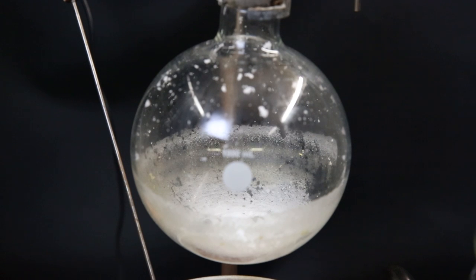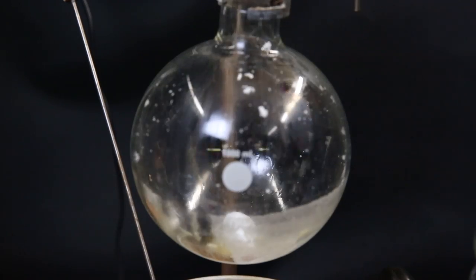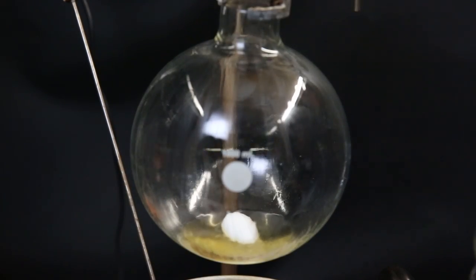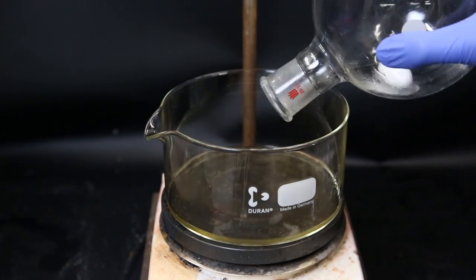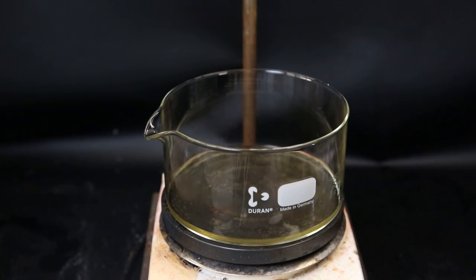Now to take out the product, I add some acetone to dissolve it and pour it all into a crystallizing dish. I wash it with some more acetone and then start heating the dish to evaporate it all off.